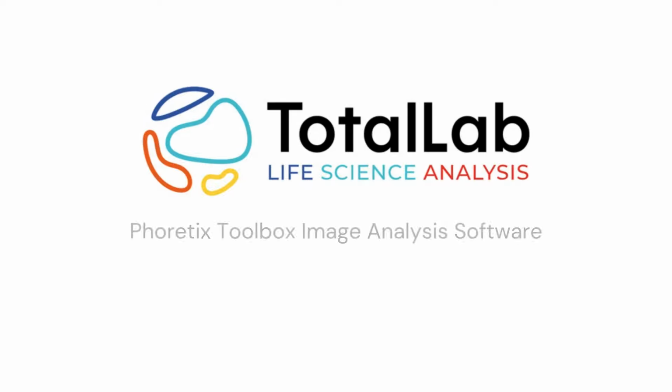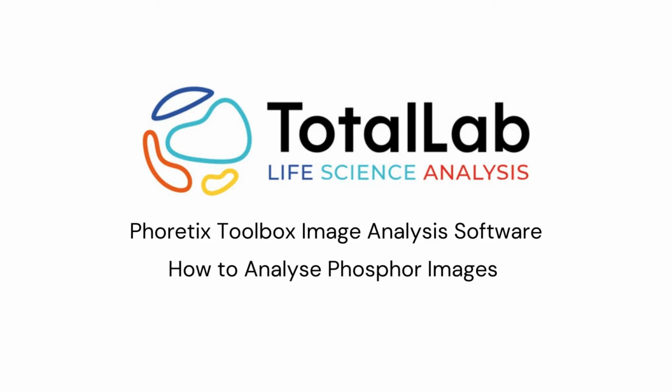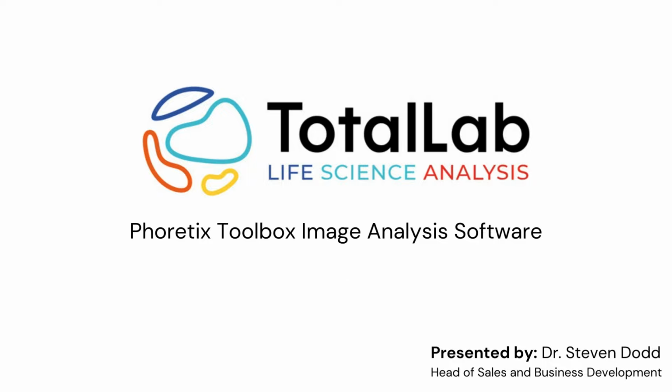Hello everyone. So today I'm going to be showing you how we can use the free-form image analysis tools built into Phoretix Toolbox to analyze some phosphor or autoradiography images.